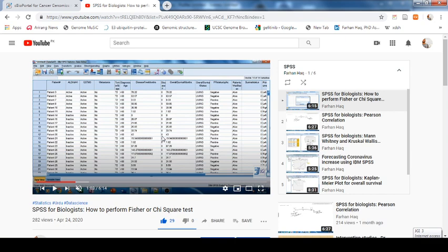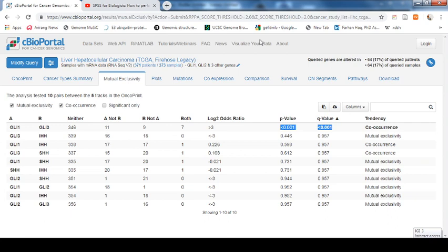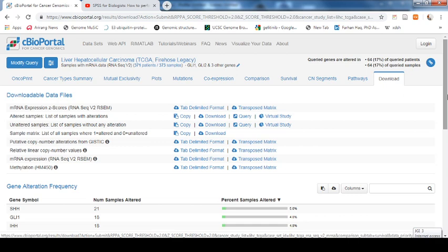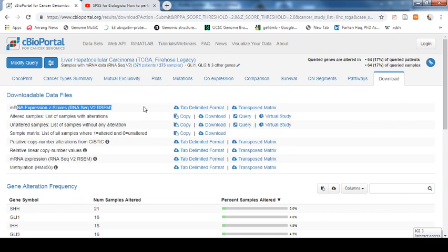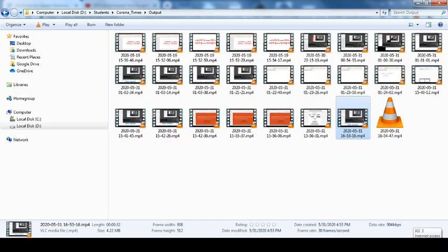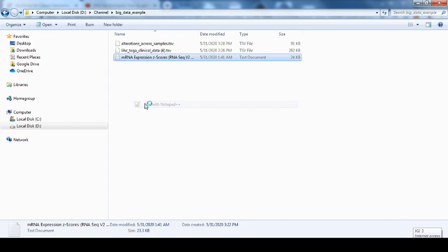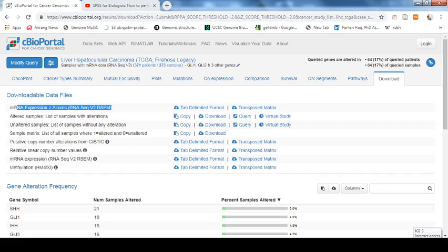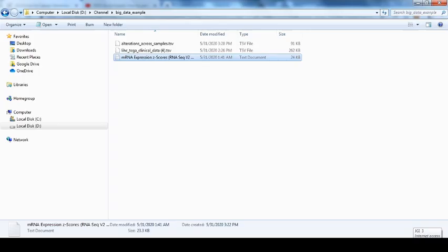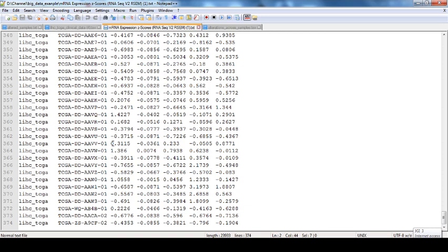Now if we want to download this information to perform these types of analysis, you can go to the download option. Here you can see that all the expression values — the mRNA expression Z-score values of the five genes — are available. You can just click download and it will download as a tab-delimited file. All 373 patients' data will be here — 374 rows because the first row has the header, so the total is 373 patients.